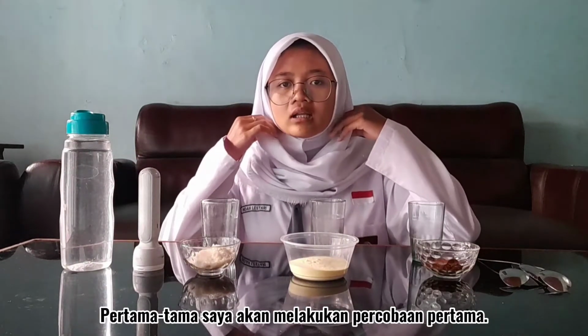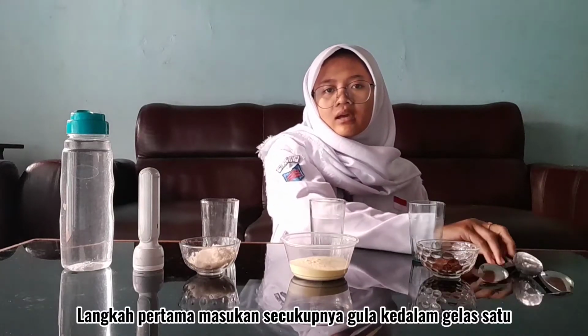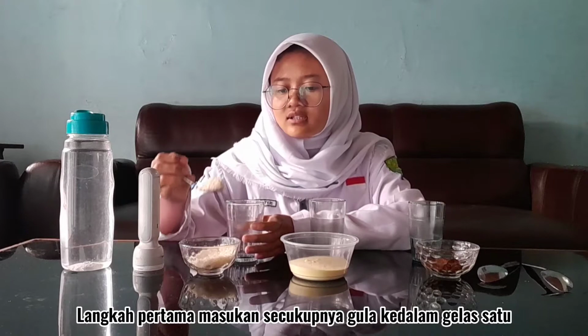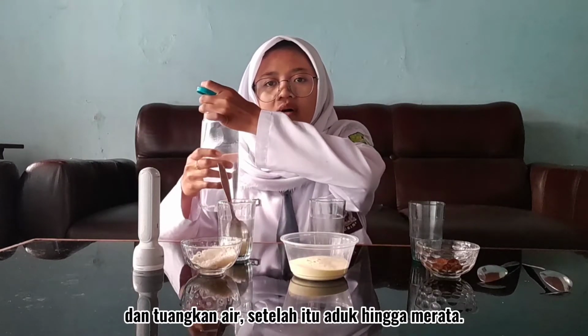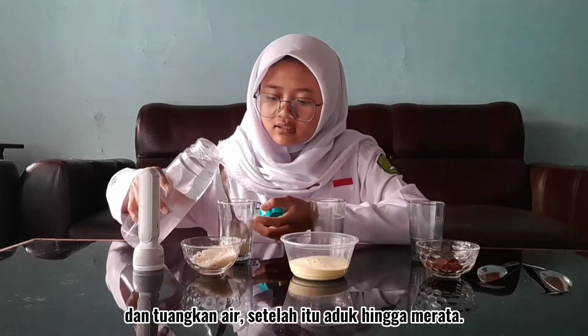First of all, I will do the first experiment. The first step is to put enough sugar into the glass, and pour the water, then stir until evenly distributed.